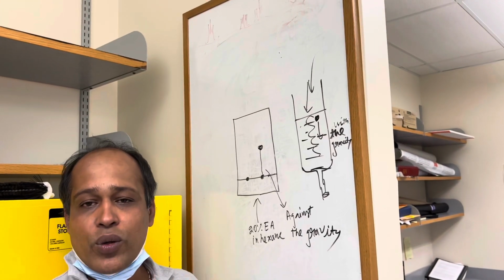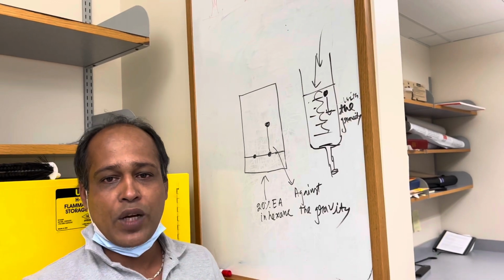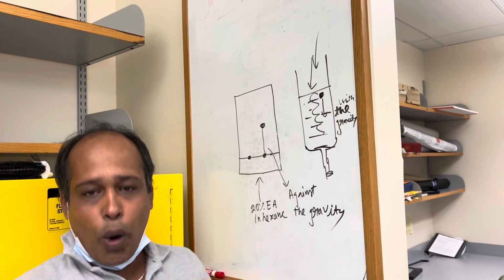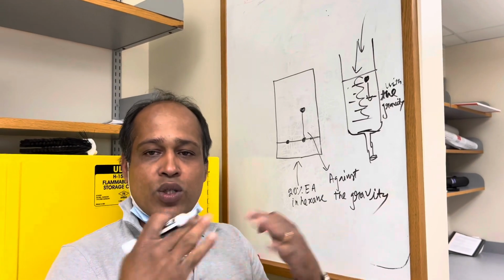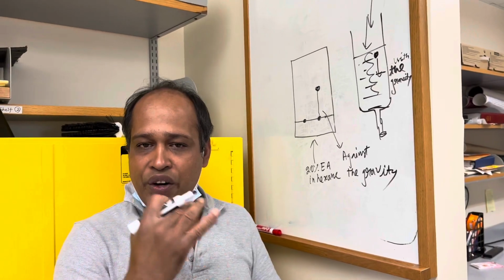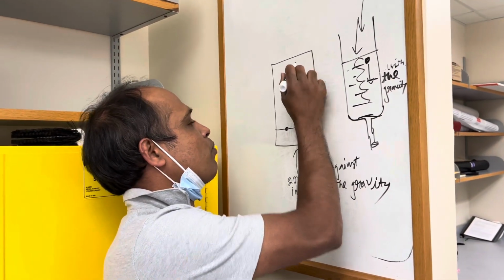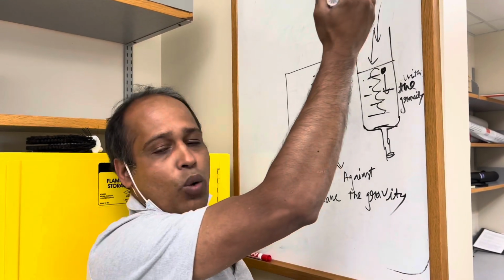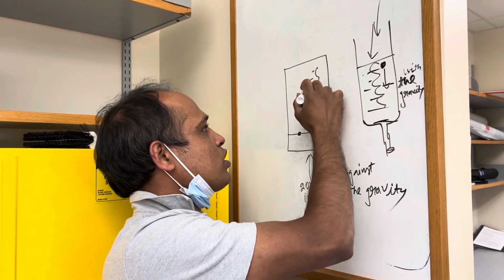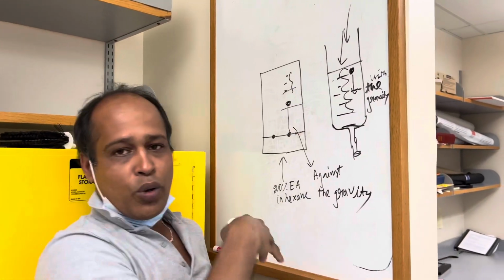Run with 100% hexane a couple of times before starting the column. See if the top spot is moving. If it is, then just wash out those things with the hexane. Suppose you have a small spot there. If those are moving with the hexane, just wash it out. And after that, once those are done according to the TLC, then you can increase your polarity to get out this compound.